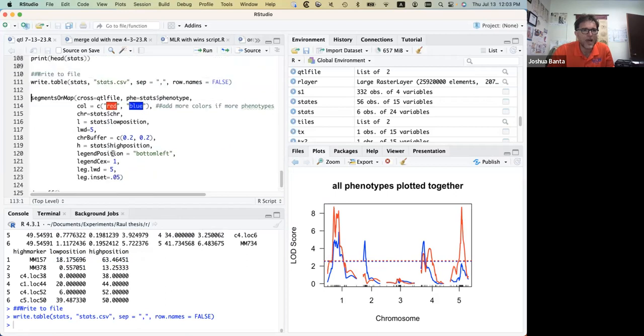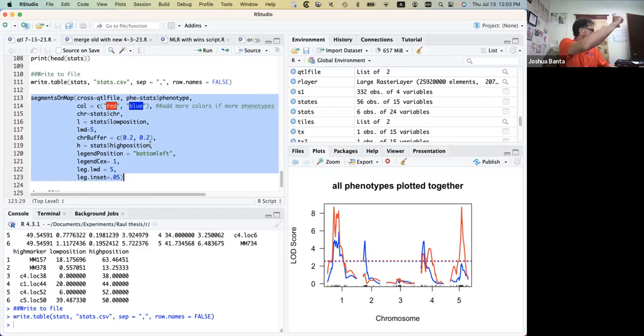And now we're going to do that second plot, where it's going to show the QTL intervals next to the chromosomes. It's like figure 2 on your poster or something. Oh, okay, yeah. You'll see in a second.